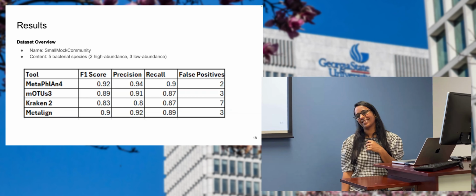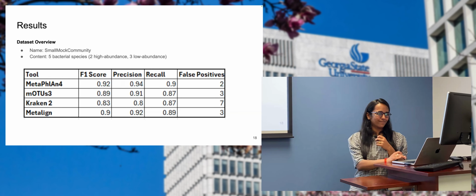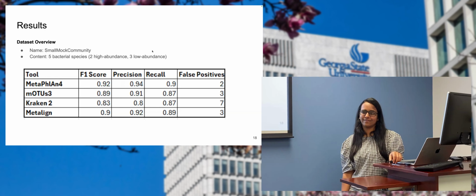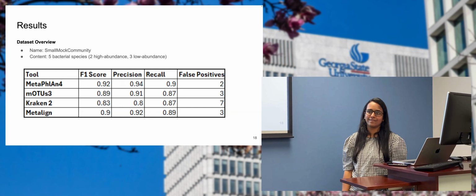First, the database. We have a lot of genomes, 4 terabytes, 5 terabytes. You have to process this on your computer.